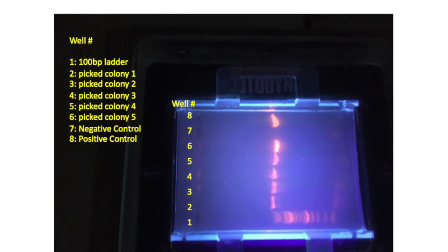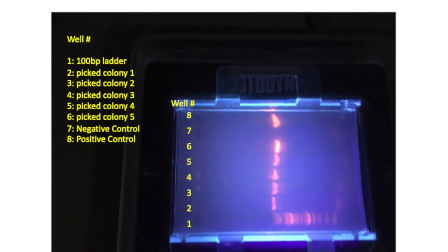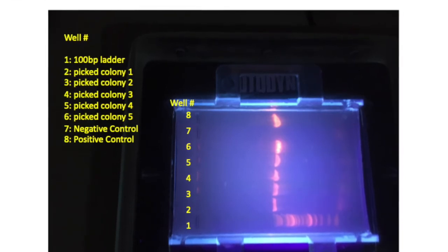At the other end, at the left-hand side, is DNA that are the largest in size. There's a bright band at 500, a bright band at 1,000 base pairs long. And you can see that most of the DNA that amplified in our samples, essentially all the DNA, is about 1,400 base pairs long.